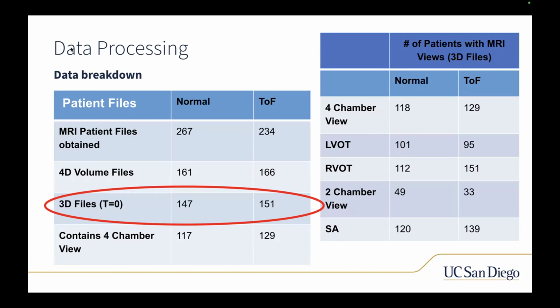I think originally we wanted to use the 4D stack, but we wanted to try our model out with just one time point to make it easier to see if it even works. That's why we started with t=0. Also, going through the actual stacks, when you switch time frames, some of them aren't aligned properly. So we wanted to get our alignment down first, and then continue moving on.